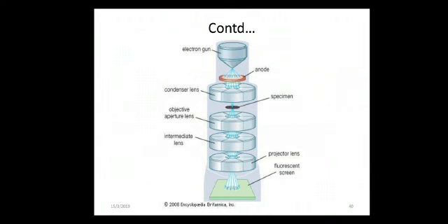So there are some advantages in this TEM when compared to SEM, also known as scanning electron microscopes.